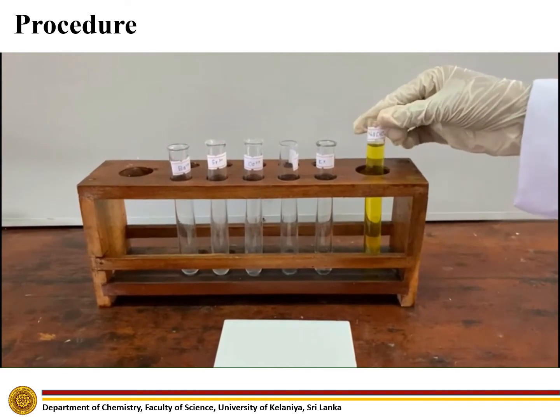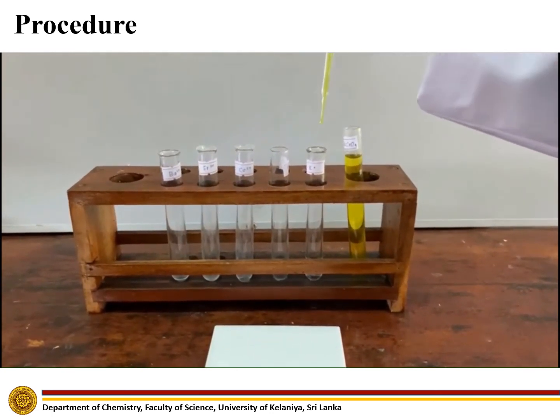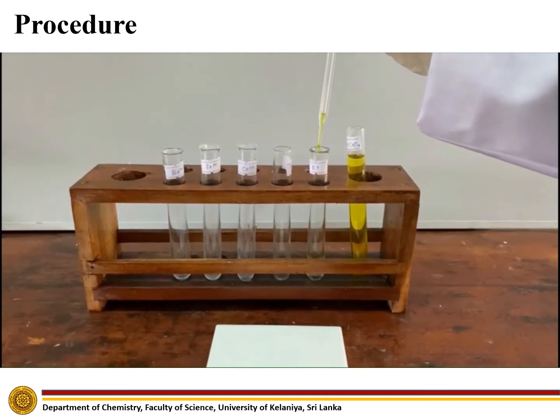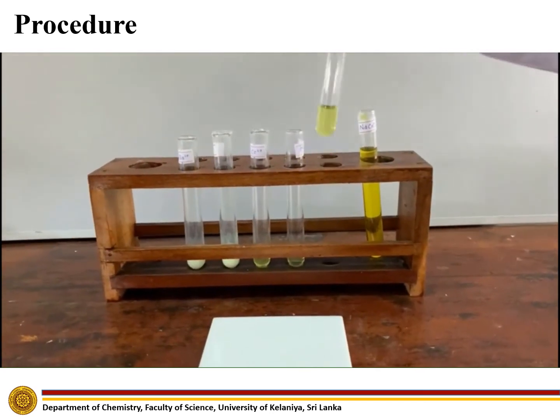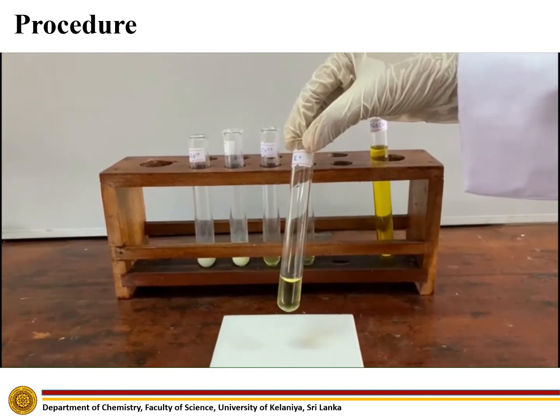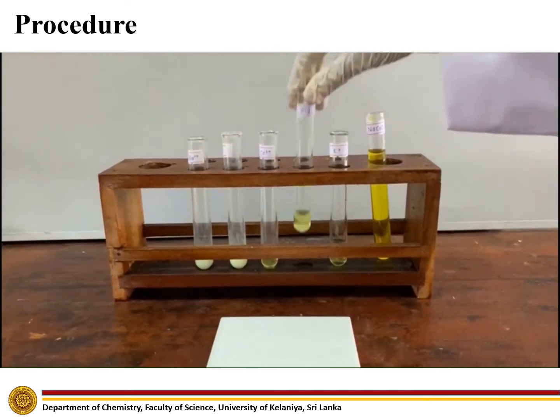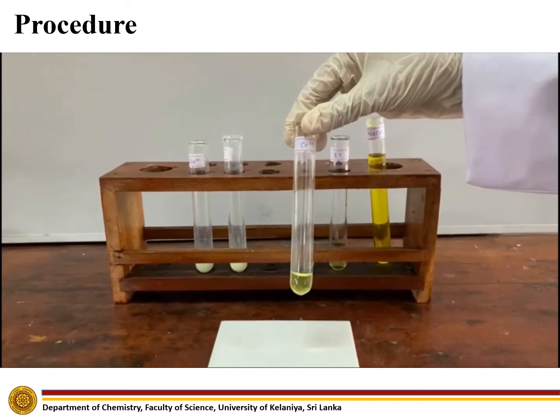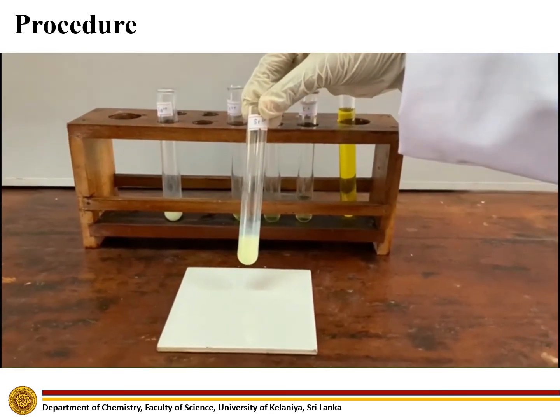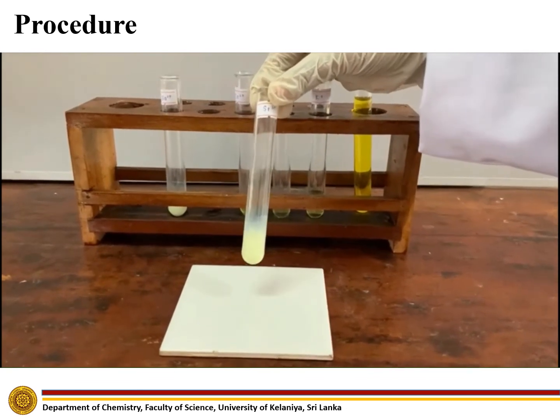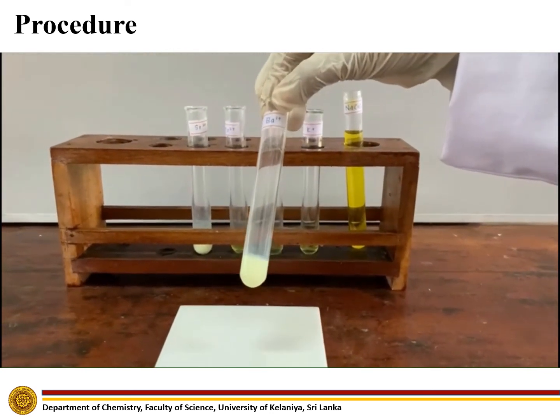Add sodium chromate to the given cation solutions. It dissolves well in potassium ion solution, magnesium ion solution, and calcium ion solution. A pale yellow precipitate forms in strontium ion solution, and a yellow precipitate forms in barium ion solution.